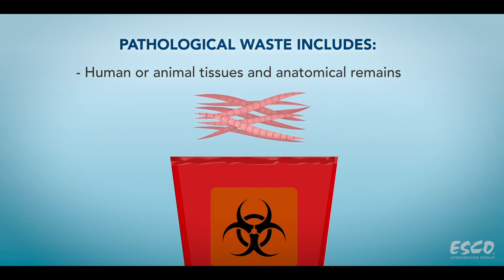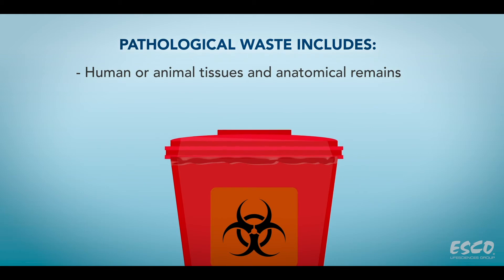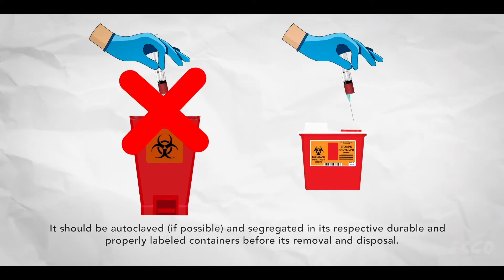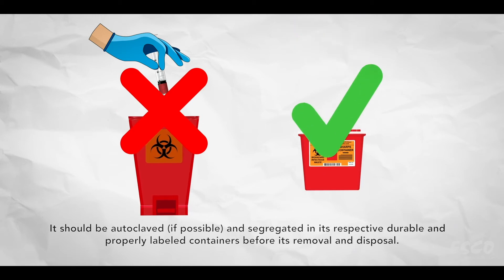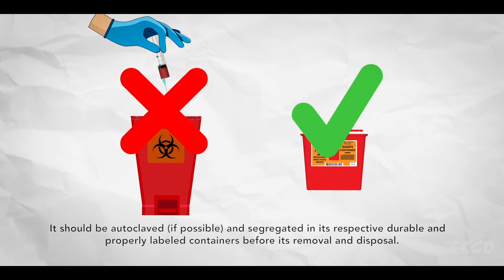Pathological waste includes human or animal tissues and anatomical remains. These should be collected in leak-proof sealed bags, autoclaved if possible, and segregated in their respective durable and properly labeled containers prior to removal and disposal.